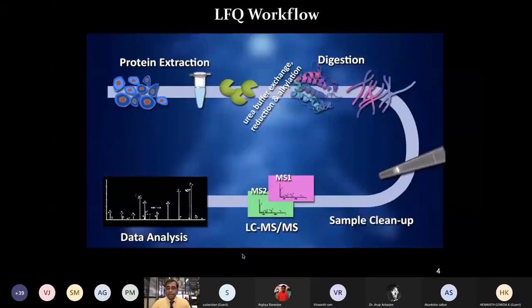We are starting with this experiment, which we started in the morning today, about performing label-free quantification. And throughout the sessions, we keep showing you how the sample run is progressing. So I feel that you are all probably, despite being virtual, feeling that you are actually in the lab, doing the experiment, and seeing how your experiment is progressing.